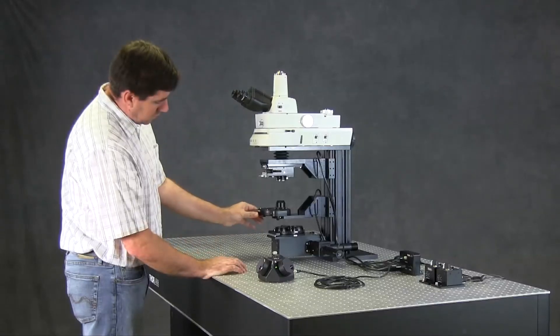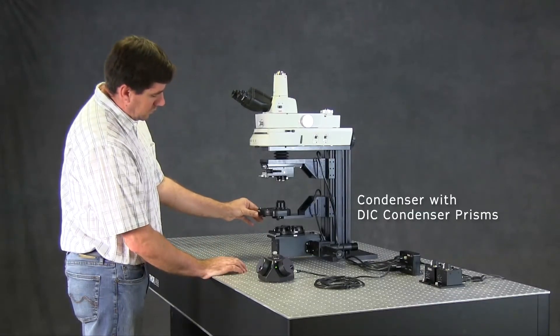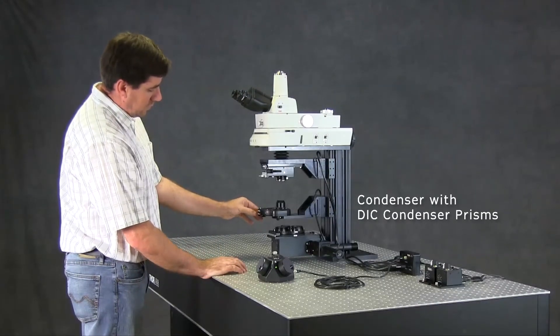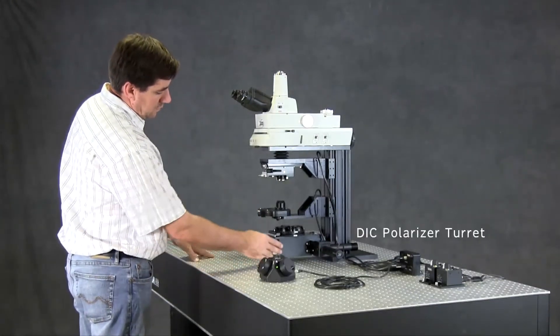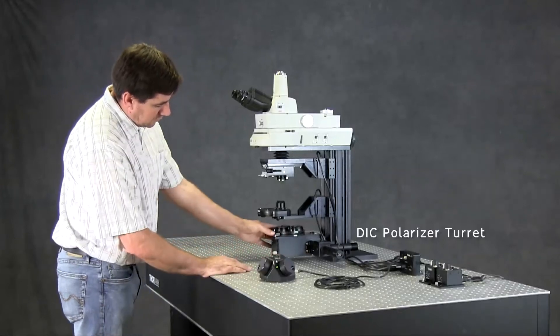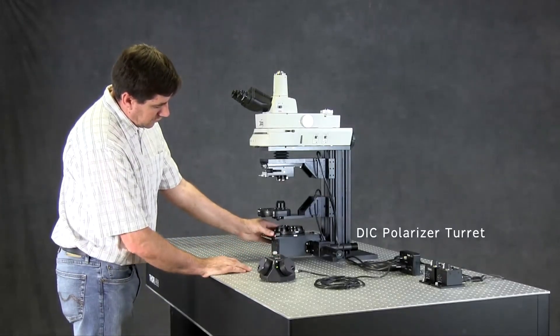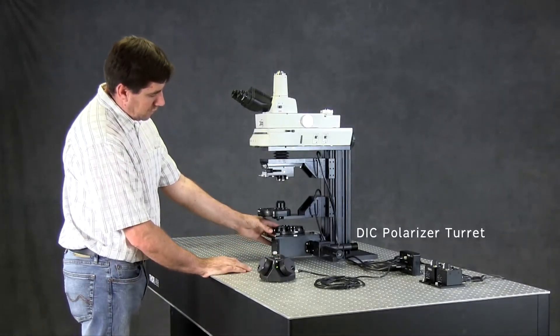Underneath the objective are a polarizer turret and condenser. The condenser includes N1 and N2 condenser prisms, and the polarizer turret, located on top of the transillumination module, includes rotatable visible and near-infrared DIC polarizers.